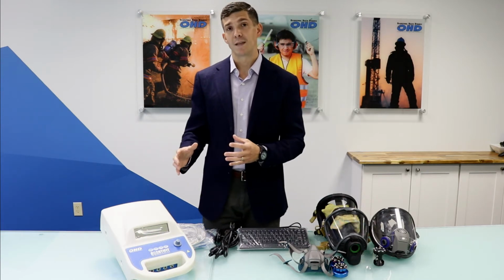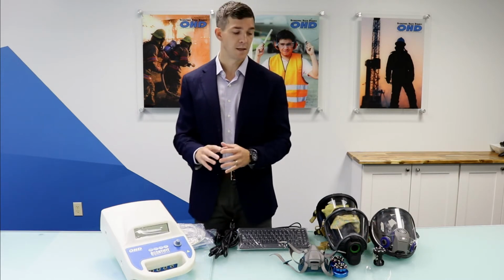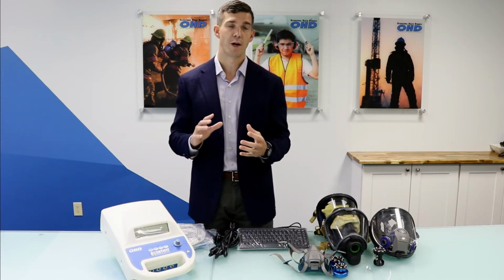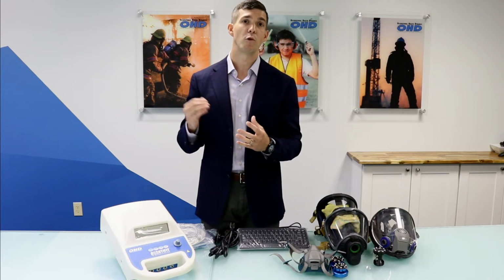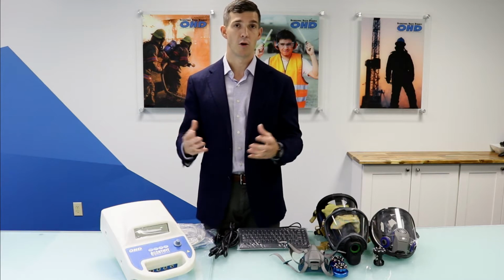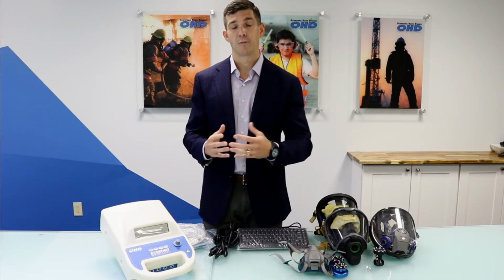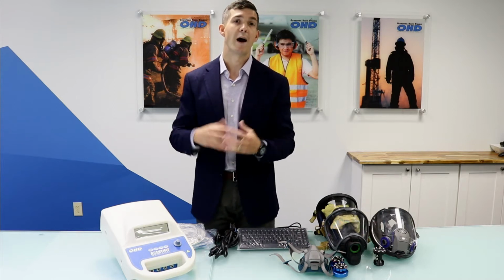What we do for fit testing is, of course, provide you a fit factor, but the way that we do that is that we pull a negative pressure on the respirator, and we actually look for leakage into the respirator during a fit test protocol. So different steps. And the higher the leak rate, the lower the fit factor. Obviously, the lower the leak rate, the higher the fit factor.